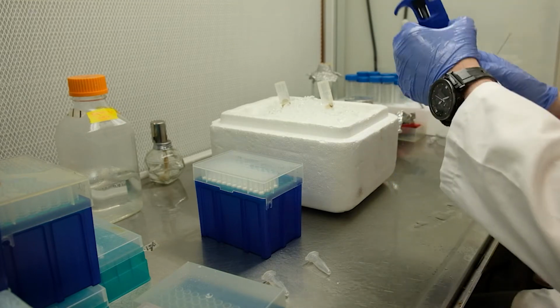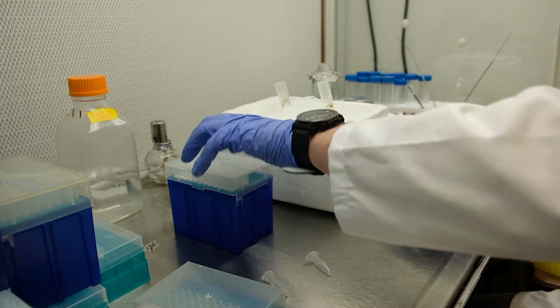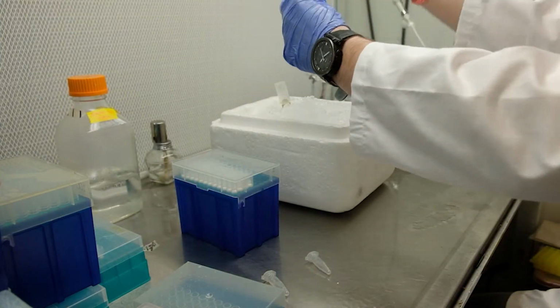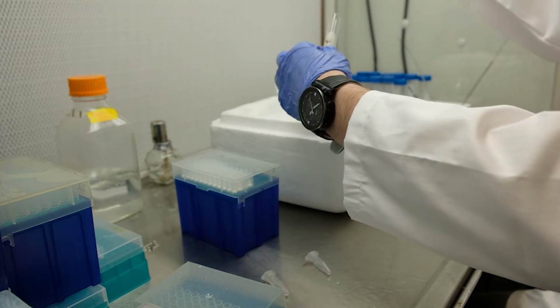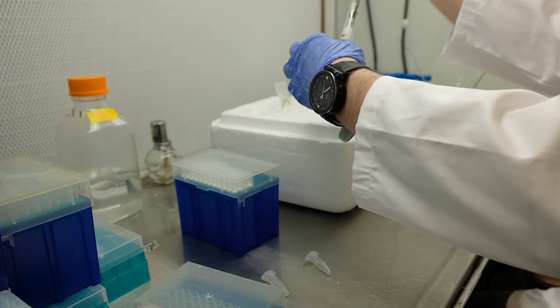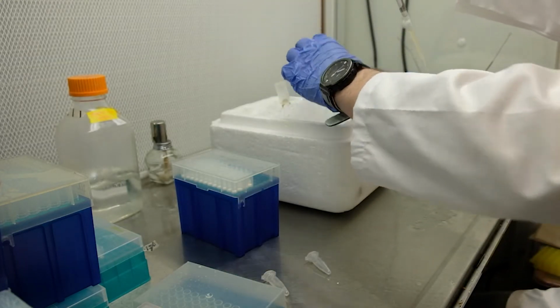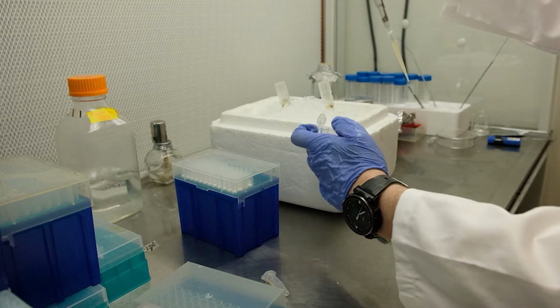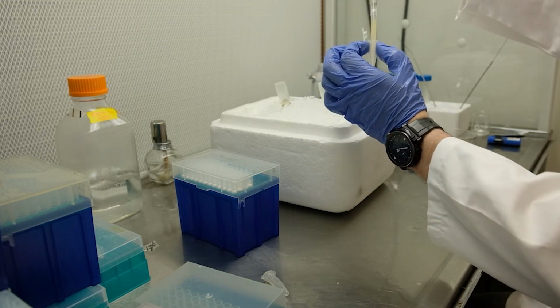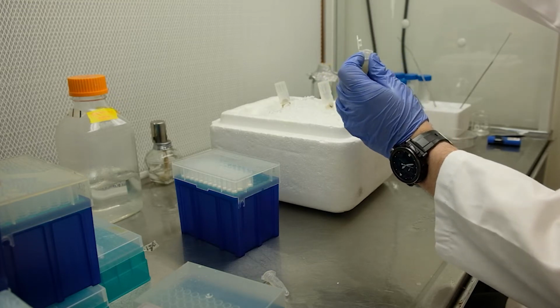Next, you'll need to transfer about 1 to 2 milliliters of your culture into each of your microfuge tubes. If you have 2 separate cultures, for example labeled A and B, then label your microfuge tubes also A and B and transfer correspondingly. Make sure to pipette it slowly. You don't want to damage your E. coli by forcing them through the opening of the tip at high pressure.